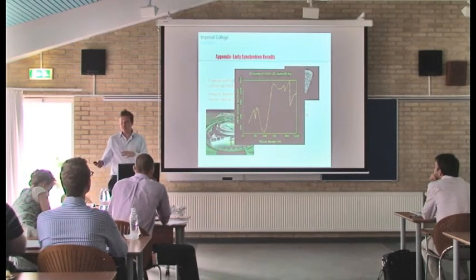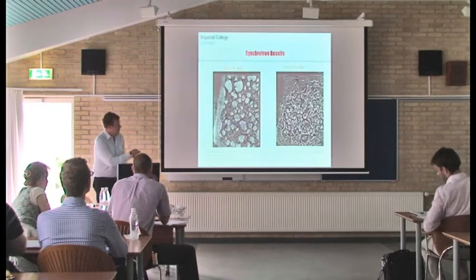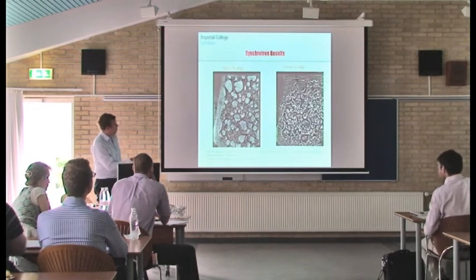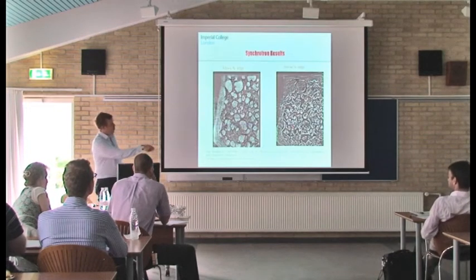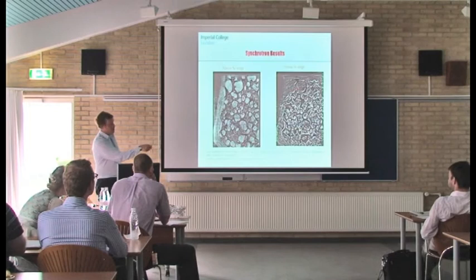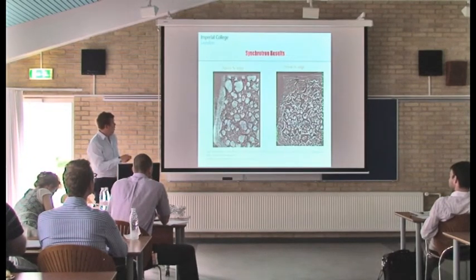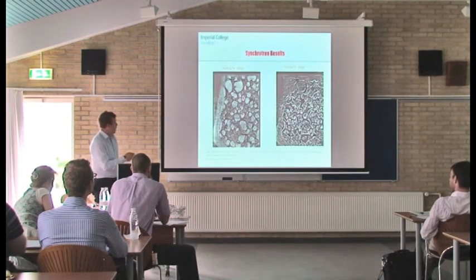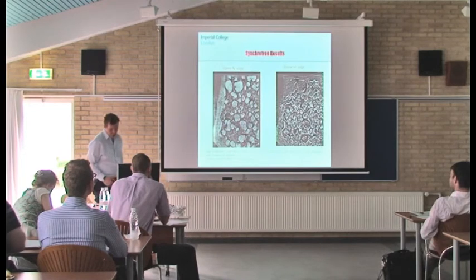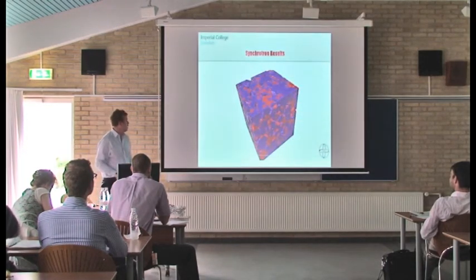So now we're getting decent phase contrast and the tomography at the same time. This is just demonstrating that. Below the nickel edge, where 8.1 kV, we can compare these two grains. You're really not seeing hardly any contrast between the nickel and the zirconia phase at all. And above the nickel edge, you're all of a sudden switching on that nickel phase, and you can get pretty decent contrast. And that allows you then to do the full 3D reconstruction.